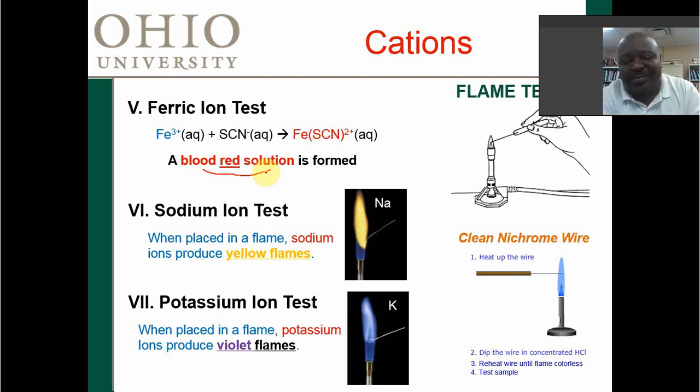Life is good. For the sodium test, I had actually planned flame photometers, but they're not yet ready. And so what we do is you'll take a nichrome wire. You rinse it a little in HCl to remove any surface impurities or impurities from a previous test.